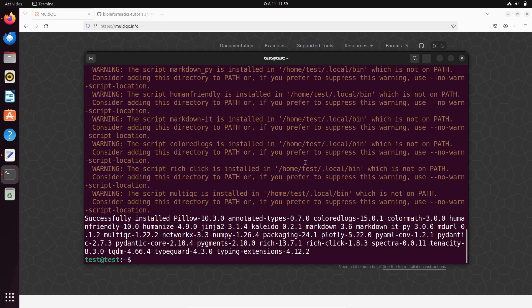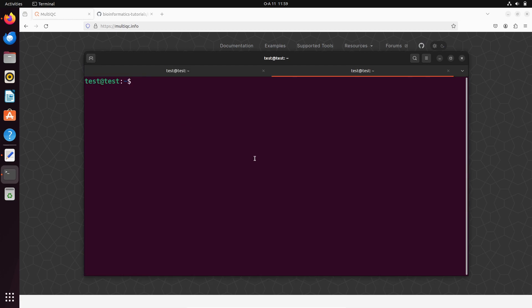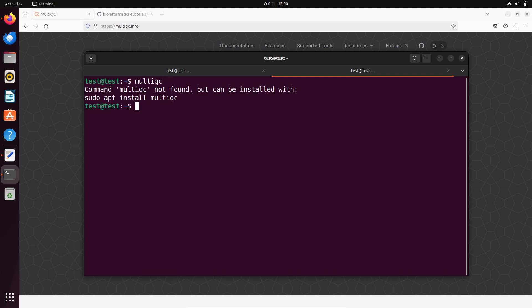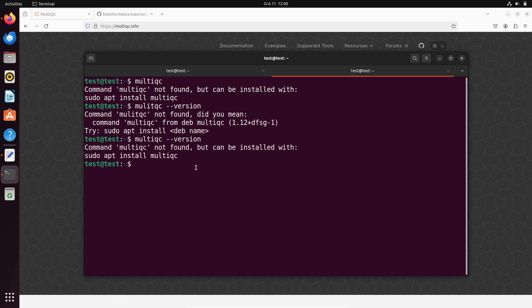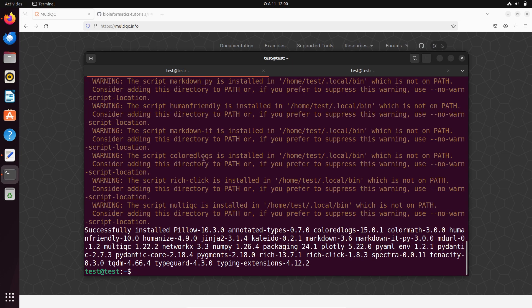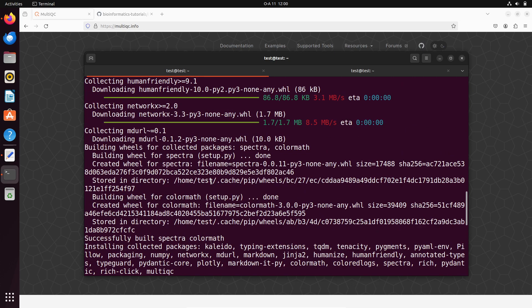Once the installation is done, let's open a new terminal tab and type 'multiqc'. If you type 'multiqc --version', it should show some output. But it still tells us that multiqc is not found, even though on the terminal where we installed it everything appeared to be successfully installed. So why is this happening?